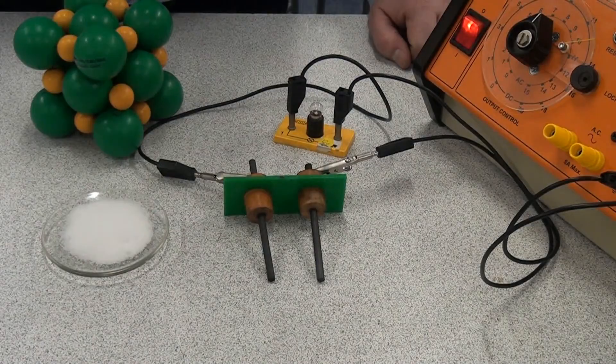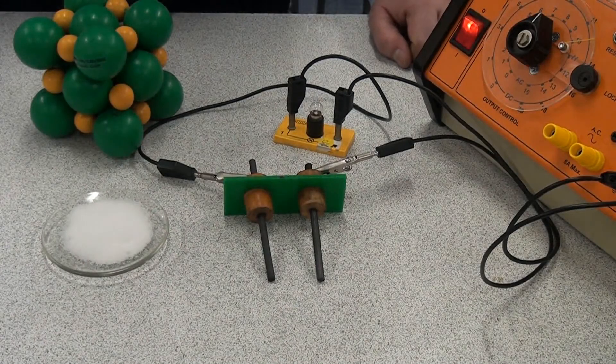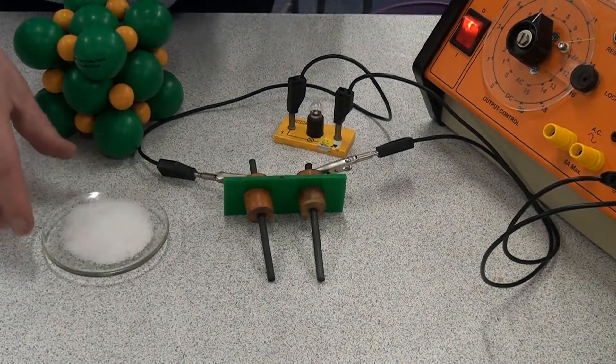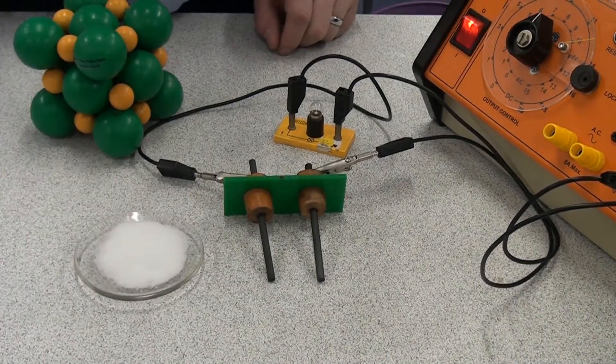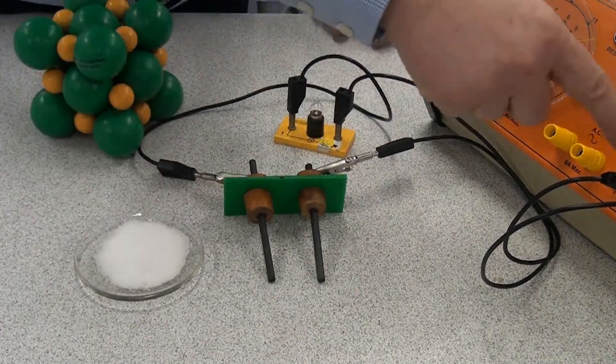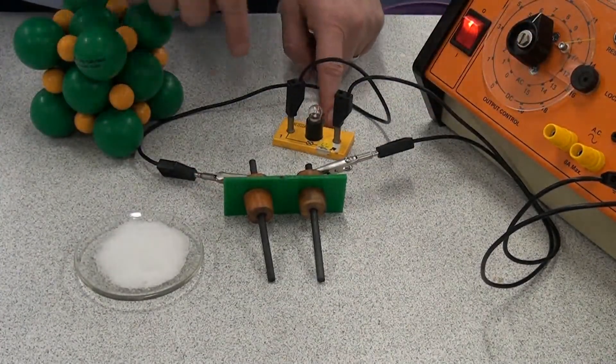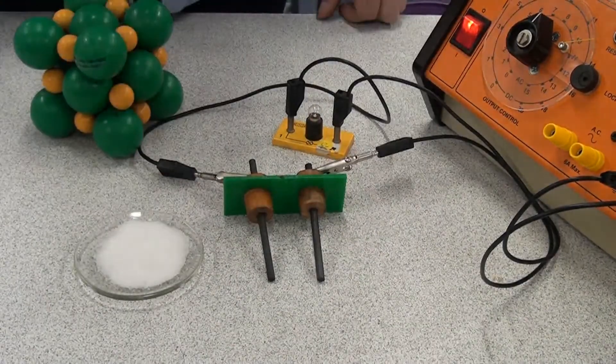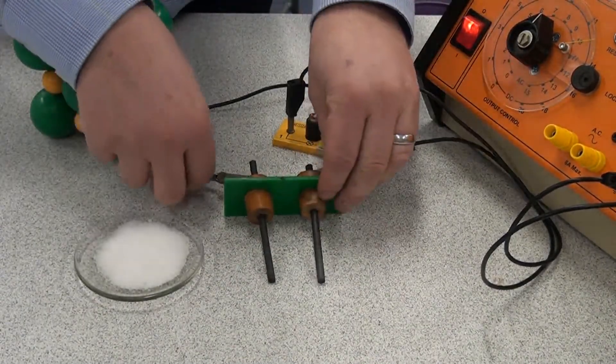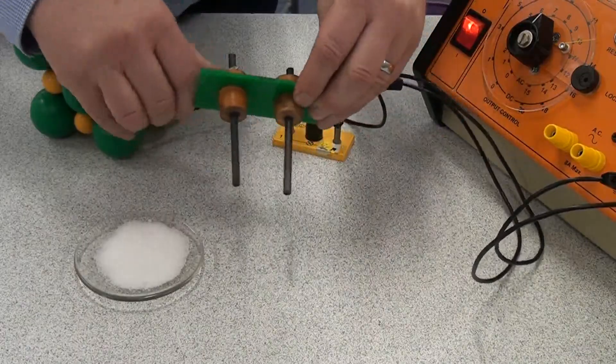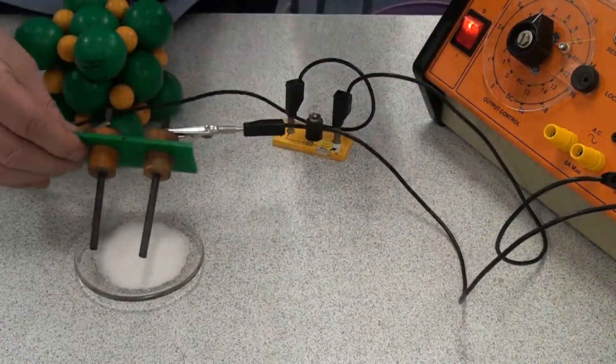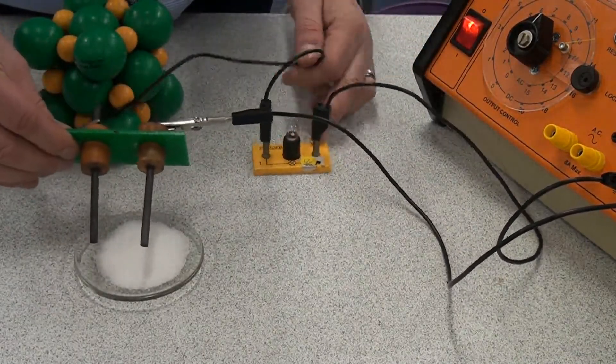So now we're going to test whether an ionic compound can conduct electricity. So I've got here some sodium chloride and I've got a power pack connected to a bulb and here we've got two carbon electrodes. So let's see what happens when we try and get the electricity to flow across this ionic compound. Will the bulb light up?